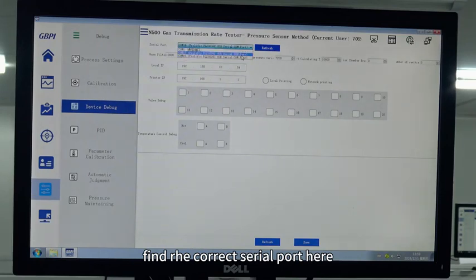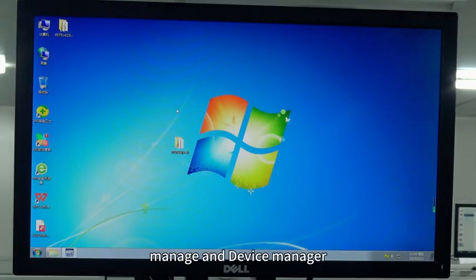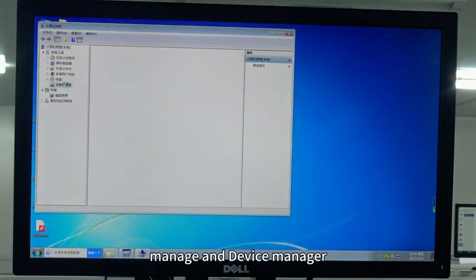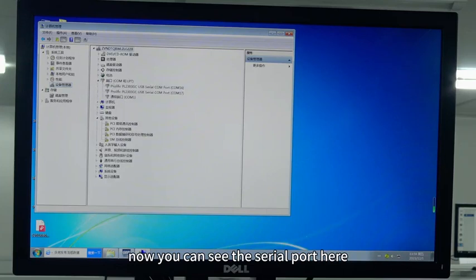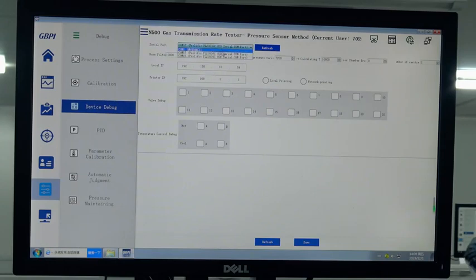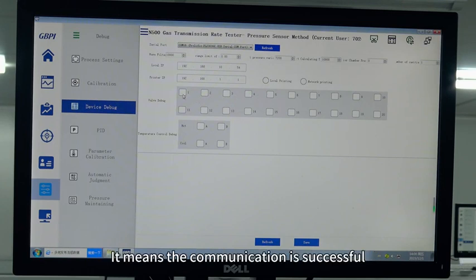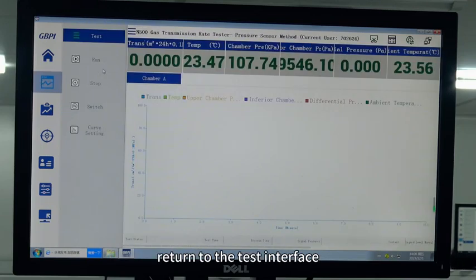Click Device, then click Device Debug, and find the correct serial port. To get the serial port, go back to the desktop, right-click This PC, go to Manage, then Device Manager — now you can see the serial port listed there. Then click on the valve; if you can hear a sound from the instrument, it means the communication is successful. Return to the test interface.